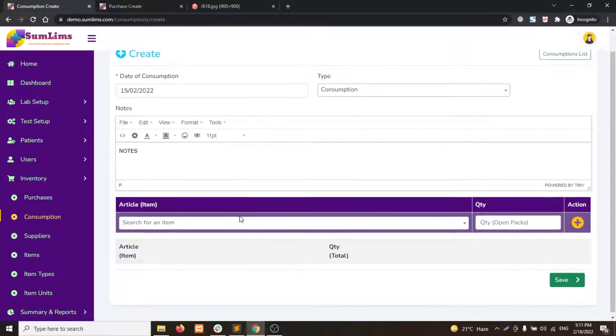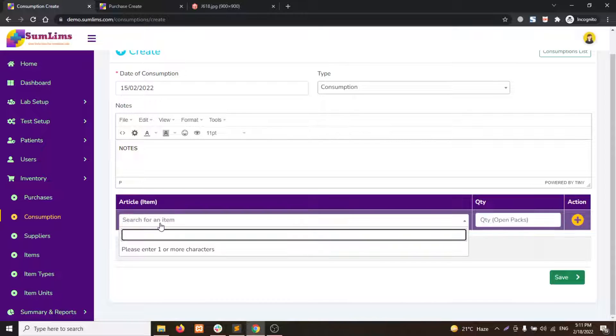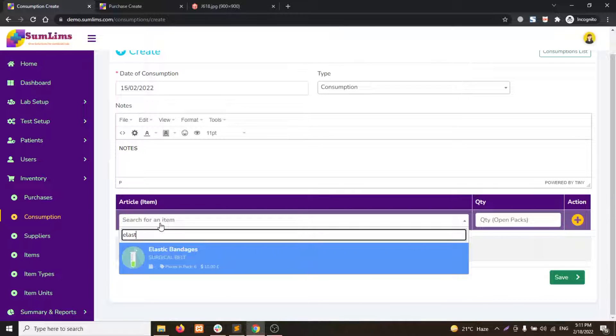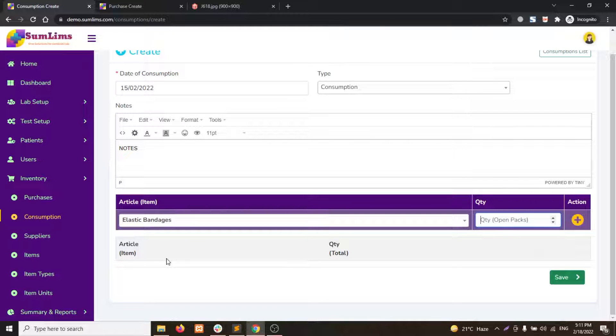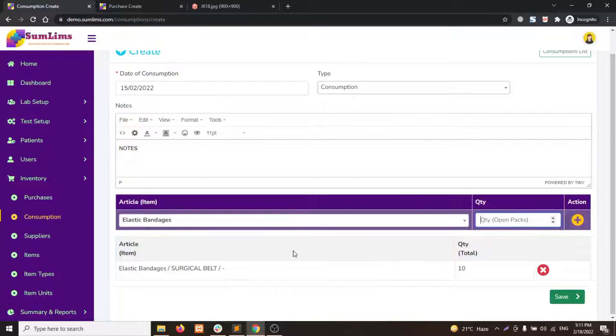The next is the selection of items from the drop-down. You start writing down the name of the item you selected. Next, you enter the total quantity. For example, 10. Click add to table and it will be added below the table.